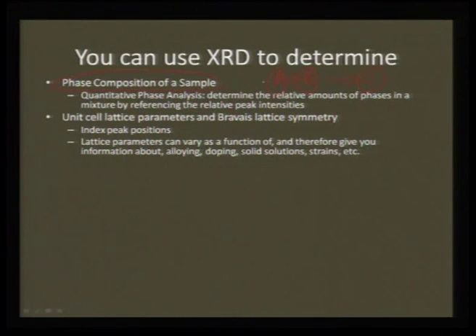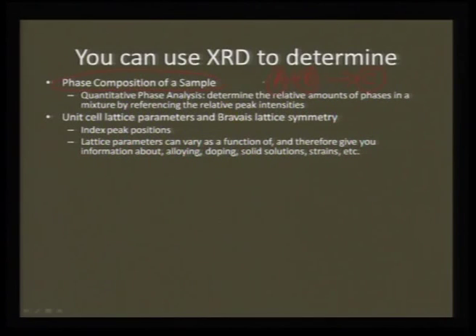Sometimes we might start with A plus B, we are expecting C, but actually it can give C prime or C double prime, which are some secondary phases which are not needed, and therefore it is easy for us to map even those phases.